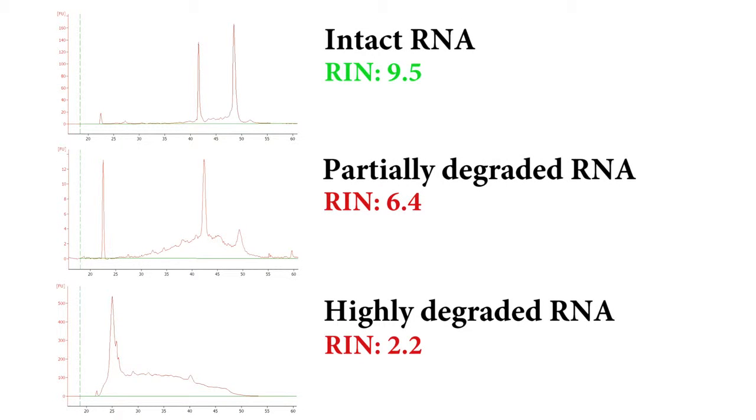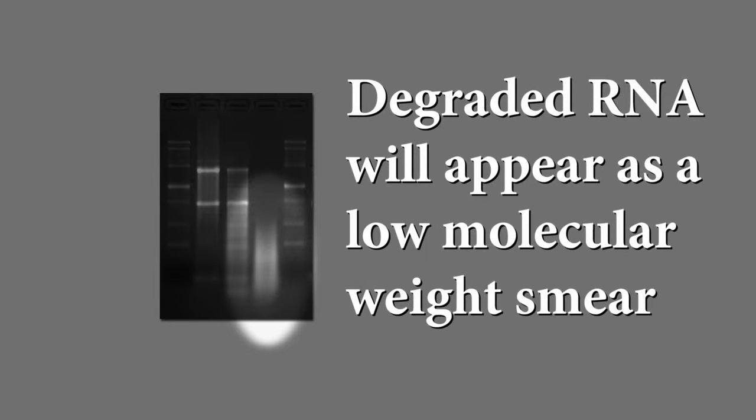Partially degraded RNA will have a smeared appearance, will lack the sharp rRNA bands, or will not exceed the 2 to 1 ratio of high-quality RNA. Completely degraded RNA will appear as a very low molecular weight smear.